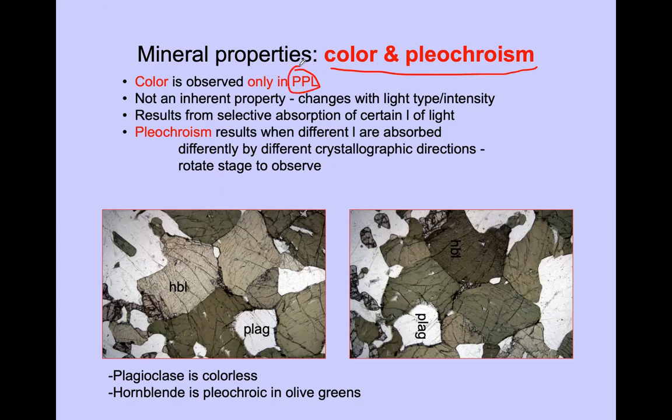Only the lower polarizer will give you the correct color, because as I said already, when the light comes to the upper polarizer, it will reorient, and only a component will pass through, and it will give you a kind of distorted color.